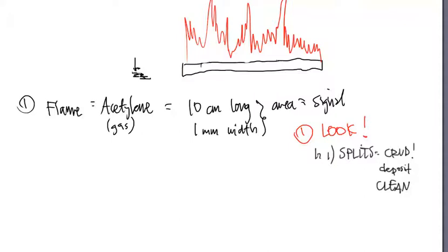So that means you're going to have to stop the machine, take the burner head out, and begin to clean it. You typically clean it, because we're working with metals, with a weakened solution of nitric acid. And this nitric acid does a much better job than soap and water, because it will go into all of these deposits that are showing up in the very narrow slit, right?